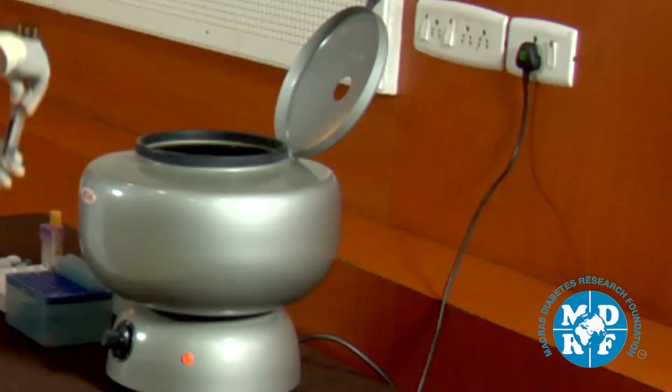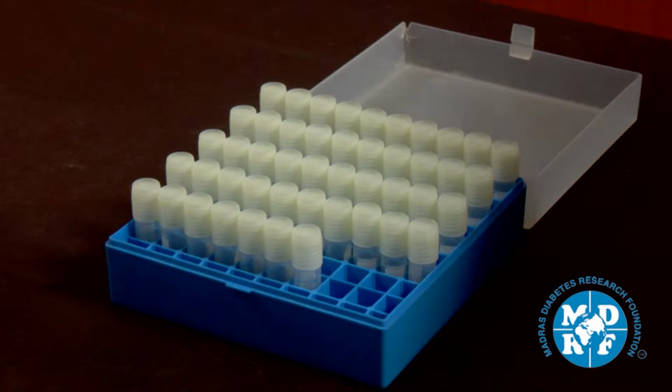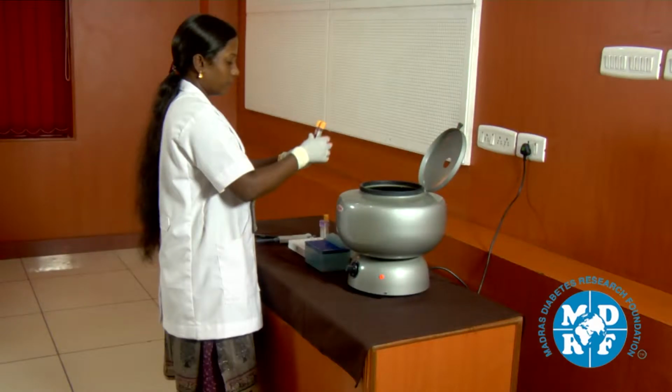We shall require the following to carry out this procedure: centrifuge, forceps, micropipette, micropipette tips, cryo vials, cryo box. Please note that only the samples from the yellow-capped vacutainer tube need to be centrifuged. Samples from the lavender-capped tubes should not be centrifuged. Centrifuge should be placed at a convenient location at the field site on a rigid flat surface.